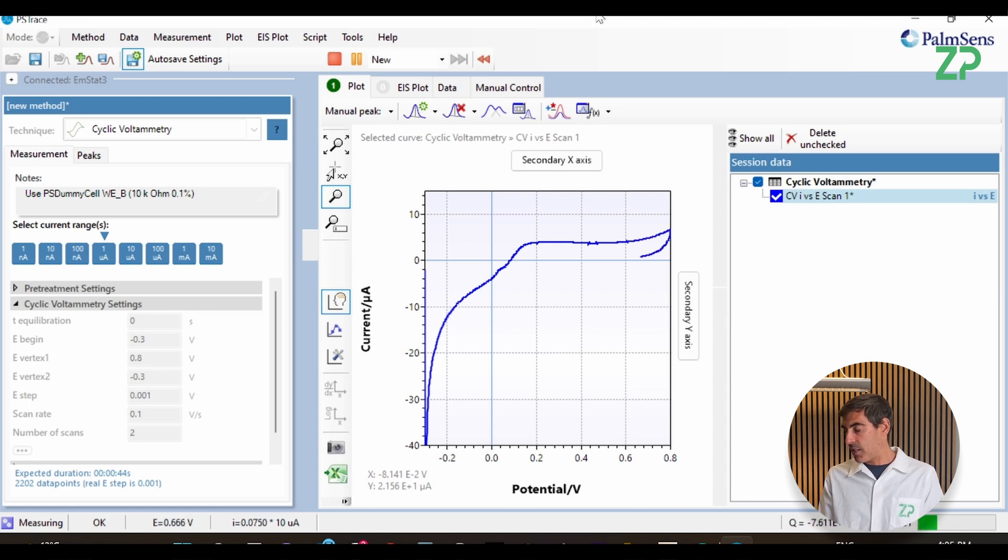And basically this is just an example. This is an illustration of what you could do. Of course, you could run a different setup. You could run an amperometric measurement where you are constantly applying a potential and measuring the changes in current depending on concentration from different solutions that you pump into the capillary cell.